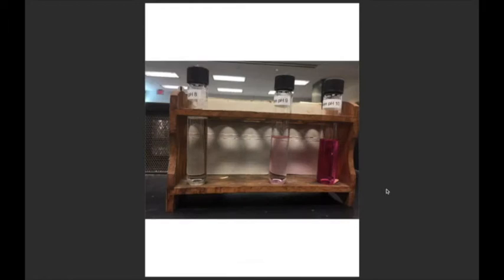Phenolphthalein has this look. It goes from colorless to that dark pink. And if you've got a light pink, you're somewhere in the middle of that range. Again, clear doesn't mean the pH is 8. It means it's 8 or lower. Dark pink doesn't mean it is 10. It means it's 10 or higher. Light pink means I'm within the color change region.